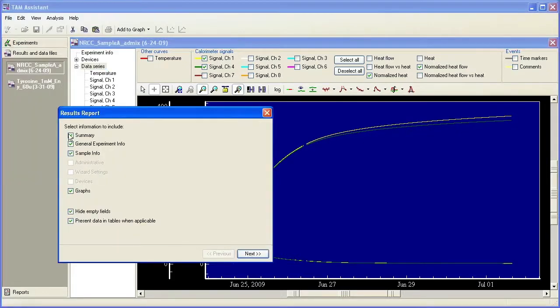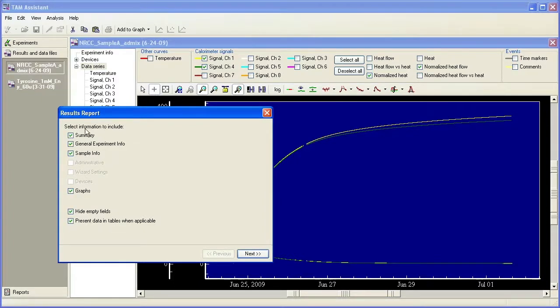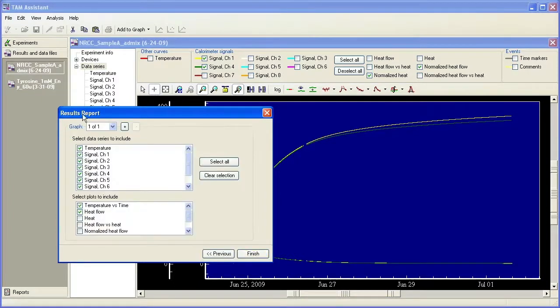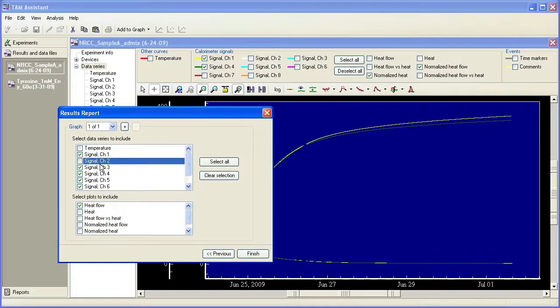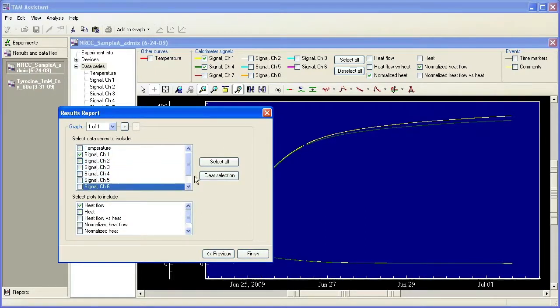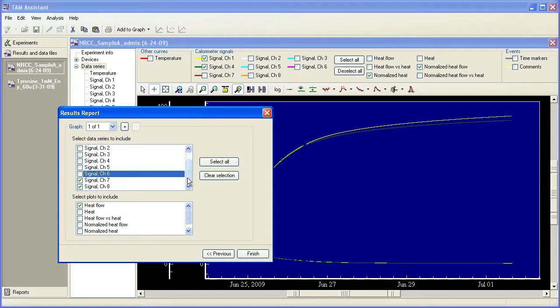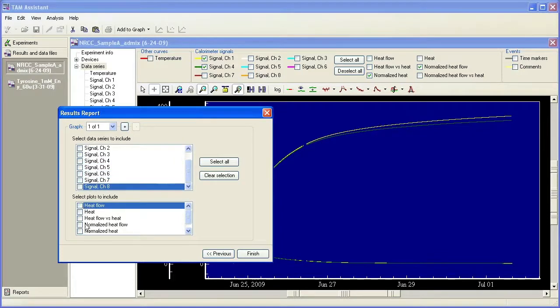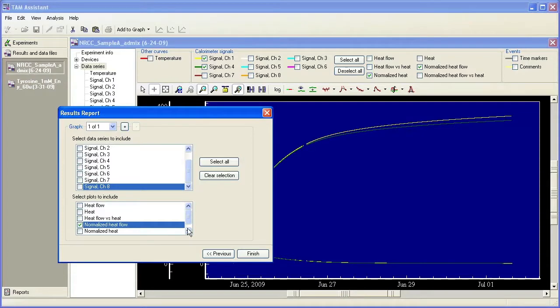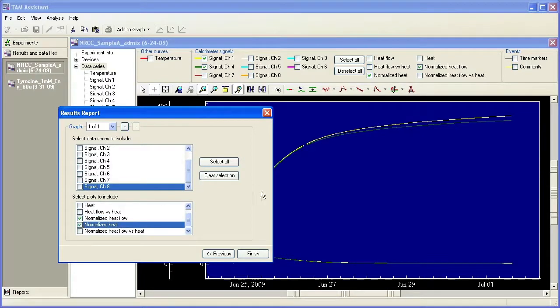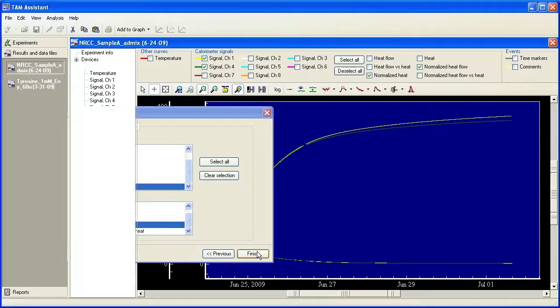So I'm just going to include everything. And then since I only want one channel, I'm going to choose channel one only out of the eight available in the TAM air data here. And I want normalized heat flow and normalized heat to be saved with my report. And I'm going to click finish.